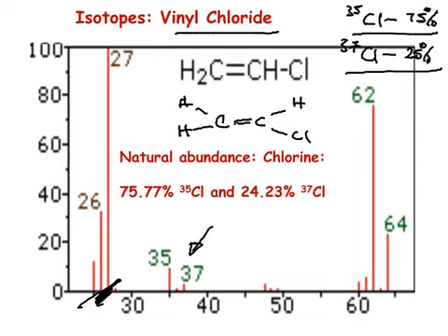We'll come to try and explain why we're getting these particular peaks in a moment, but let's take a look up at the molecular ion. Think of the molecular ion as the molecule itself with an electron knocked off it. And with an electron knocked off it, it's not going to affect its mass. So let's work out the relative molecular mass of the molecular ion.